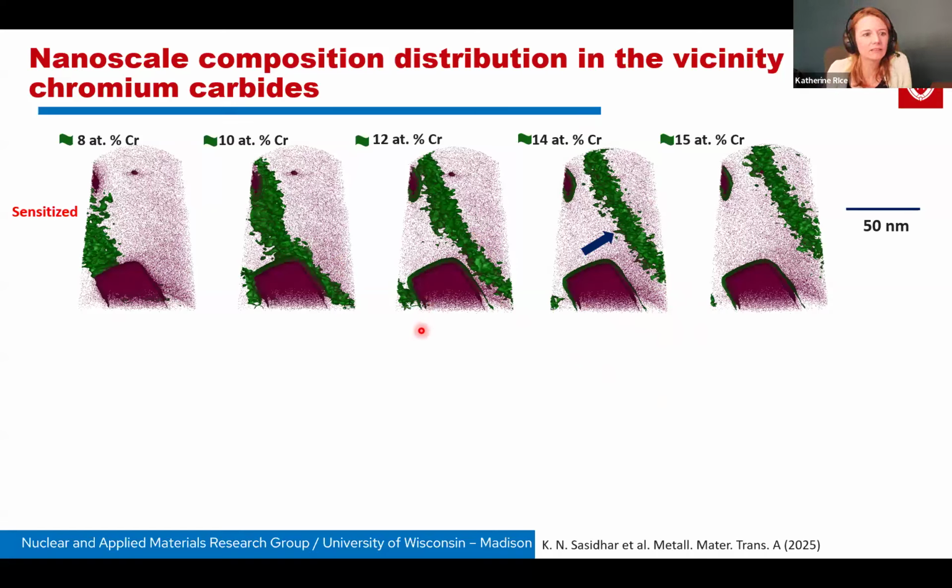And I think that's it for the customers. I just had one more question here, Sasadar. Do you see that kind of cubical geometry in other techniques, SEM, TEM? Yeah, that's another great question. The three-dimensional morphology is something we could not see in any other TEM technique.